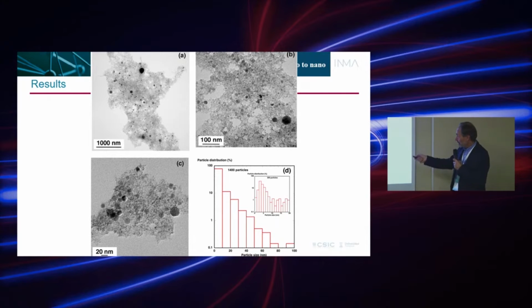This is done statistically by measuring the nanoparticles here. And you can see also a sort of bimodal distribution here with the very small particle size. And this is about 3 nanometers, more or less the medium size here, or the maximum in the distribution, although it's not really symmetrical. So it's shifted to the right, on a hump. But then you have also a distribution here, and you have the large ones that you see.